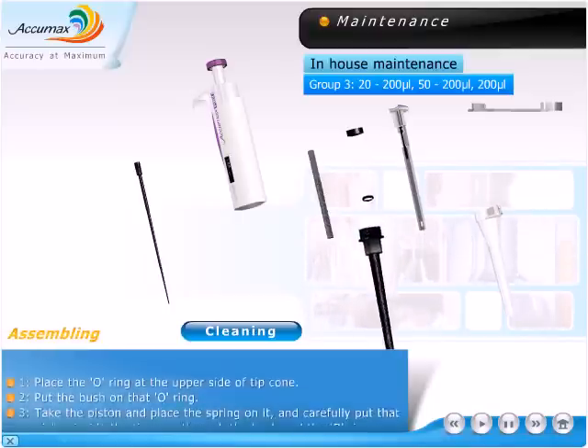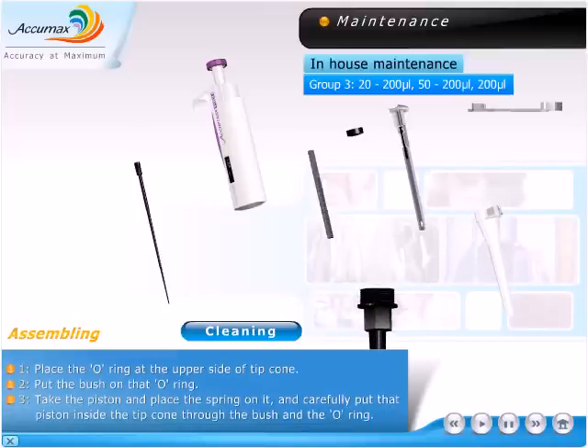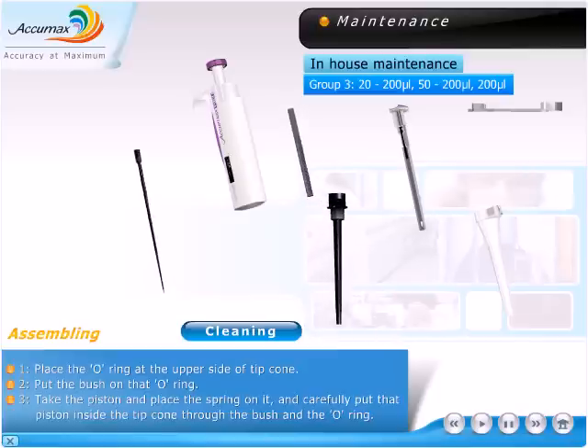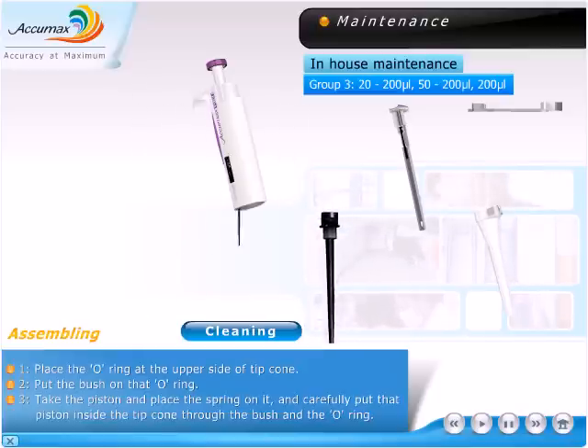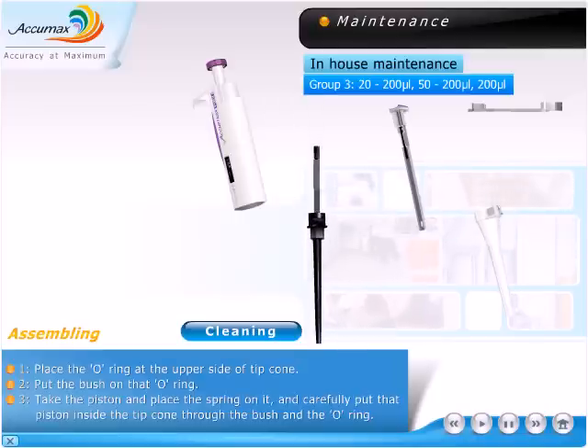Assembling. Place the o-ring at the upper side of the tip cone. Put the bush on that o-ring. Take the piston and place the spring on it, and carefully put that piston inside the tip cone through the bush and the o-ring.